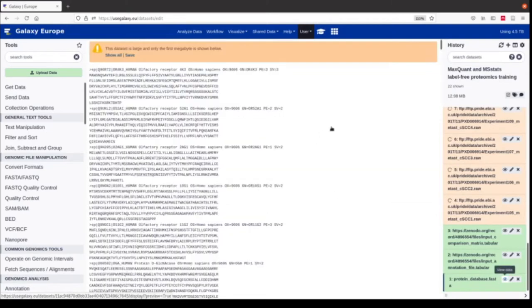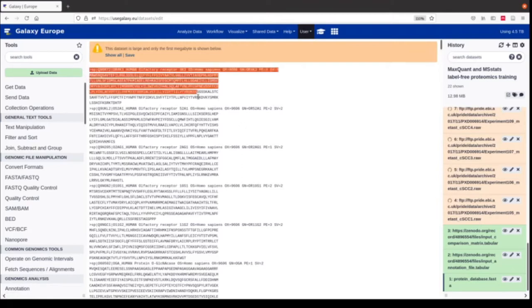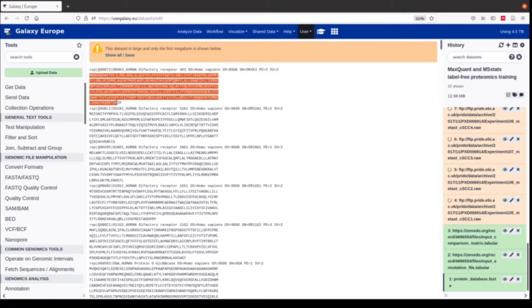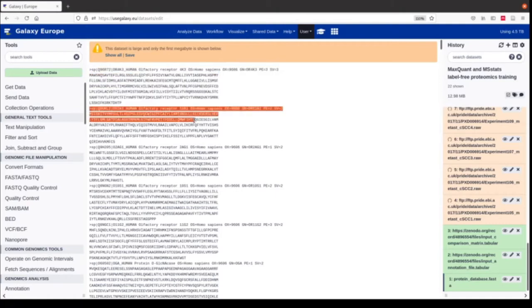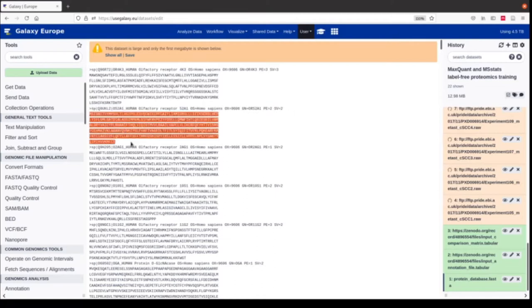This is a FASTA file with all human protein sequences. When we click the info button to open the beginning of the file, we can see the header line which contains the UniProt accession, the protein name, and a bit more information. Afterwards we have the amino acid sequences of each protein and so on.